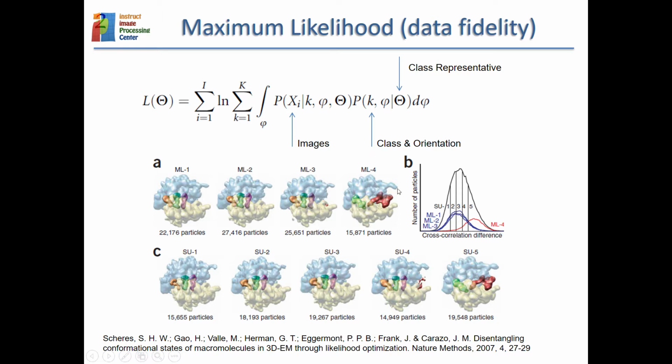So let's say that you have 100,000 images, and you classify these 100,000 images into 4 classes. 3 of them may be the same one, simply because you have asked for 4 classes, but in practice you had only 2. So the biggest class is split into 3 classes.